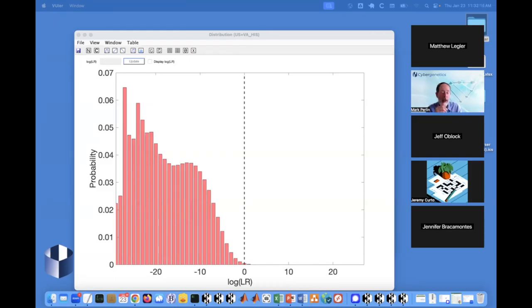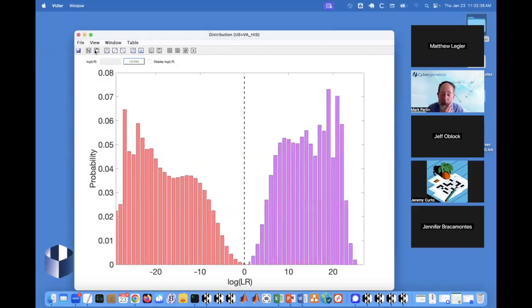But what we couldn't do with the technology back then was the equivalent of sampling all trillion possible genotypes that represent the true contributor distribution. But at the click of a button, that is the contributor distribution. That's what it is, and it's built in.